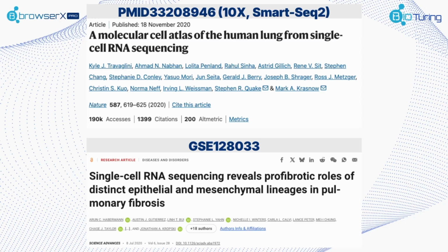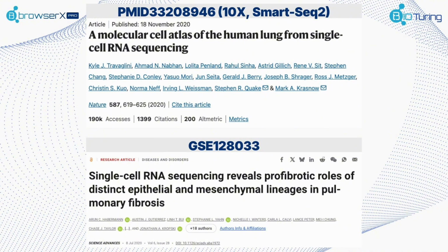To introduce the study first, these 3 datasets were taken from 2 sources: the Human Lung Cell Atlas from the Chan Zuckerberg Biohub SF with a PMID number, and the Habermann 2020 paper with a GSE number. You'll also notice that we have 2 PMID datasets. One was sequenced with 10x, and the other one with SmartSeq2. I plan to integrate all 3 and perform batch correction.